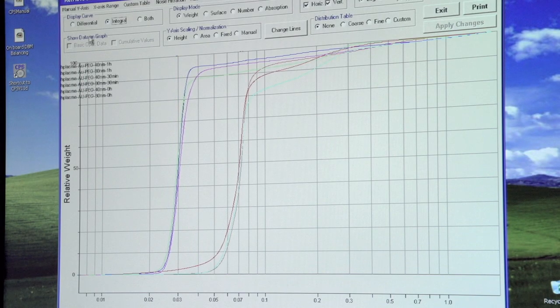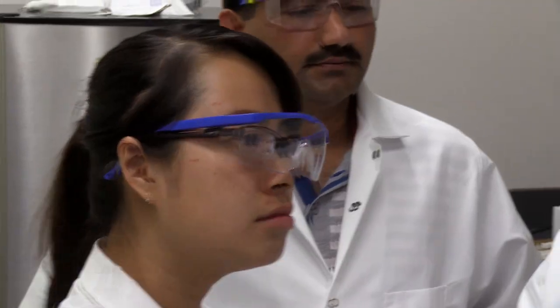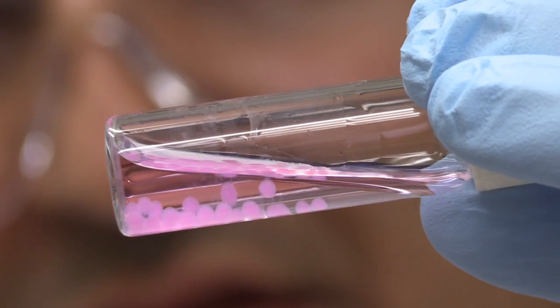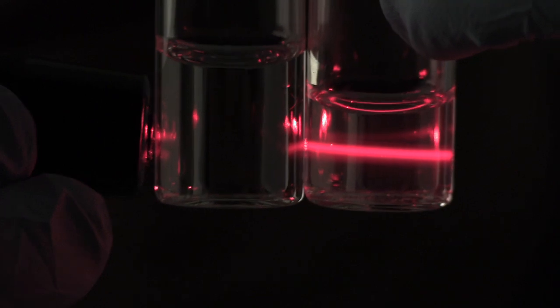One medical use for nanotechnology the center explores is how to deliver drugs and other substances to cells that need treatment. In our laboratory, we work at the interface between biology, chemistry, and engineering. When we talk about drug delivery, the final target where we want to deliver the drug is the cell. I work in the surface modification of the nanomaterials such that they can be targeted to the specific cells which have a specific disease, and these nanomaterials can be loaded with various payloads like small molecules, contrast agents, fluorescent dyes that will help the clinician in the operation room to visualize the event.